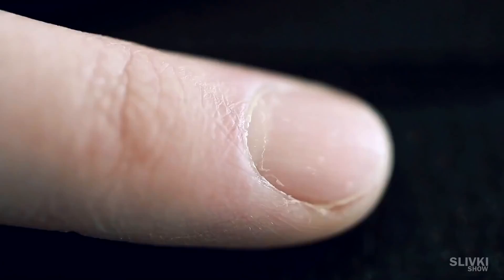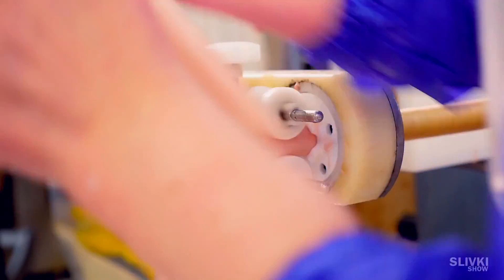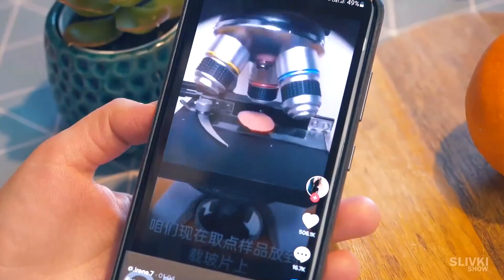In this video we take a look at a human fingernail under a microscope. We compare fresh and used car oil, as well as what is actually put into a sausage — and sausages that we eat.